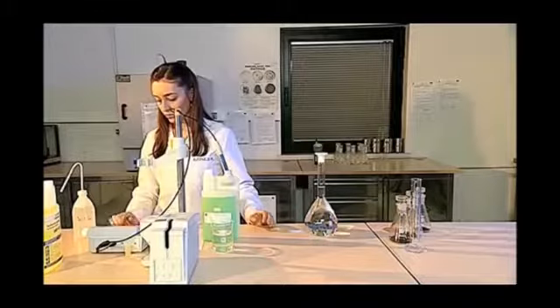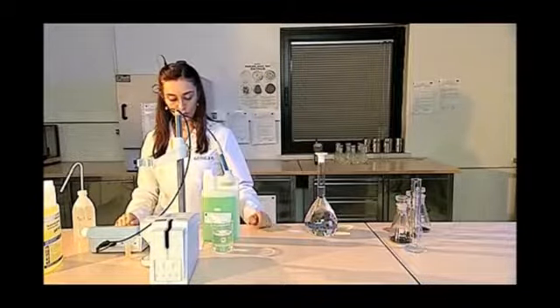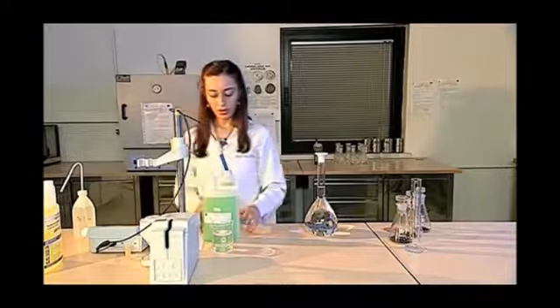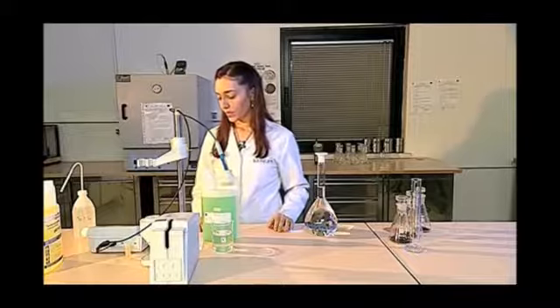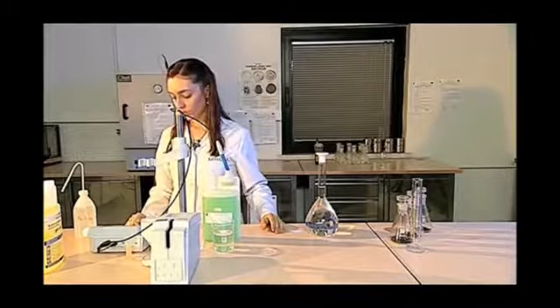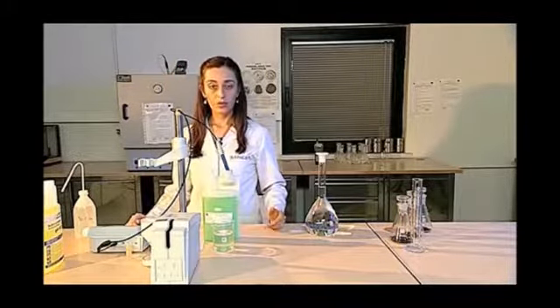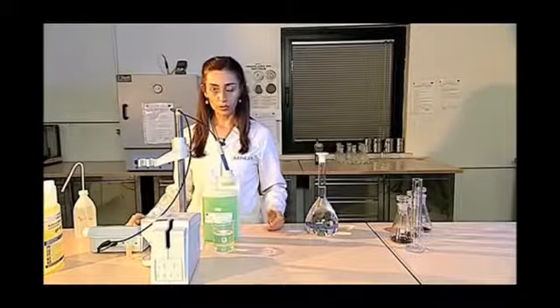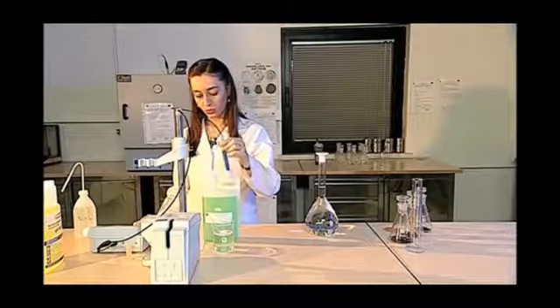We start the measurement with the calibration step in the pH meter. First, we find the asymmetry value in the pH meter. The measurement is completed when the pH is fixed. We compare the value we see with the table value and decide that there is no problem with the calibration of the pH meter if the value is between the value range. I stop it when it is fixed.